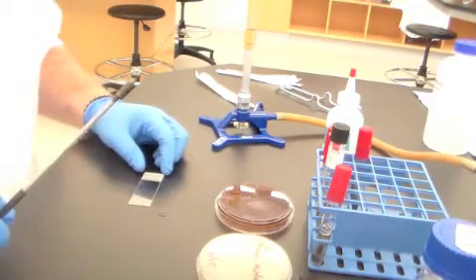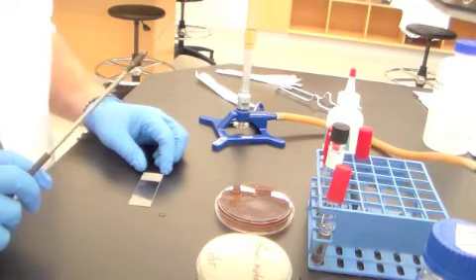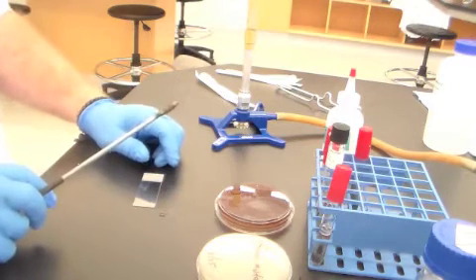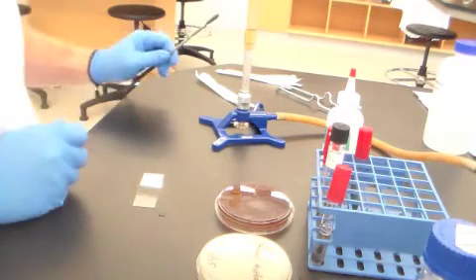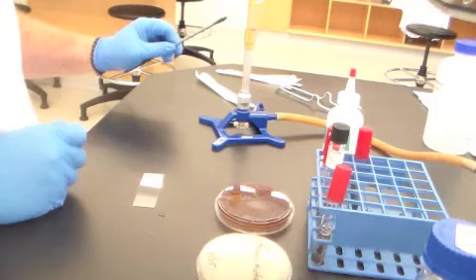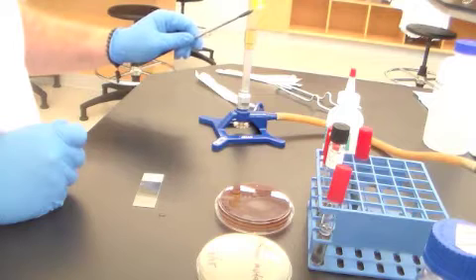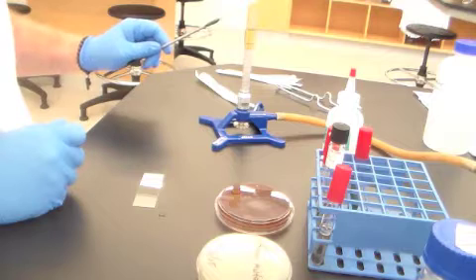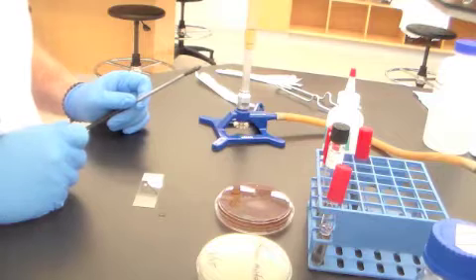It's really assaying whether a bacterium has the ability, or has evolved the ability, to actively deal with the toxic effects of oxygen. So even organisms that grow in the presence of oxygen, that require oxygen, that utilize oxygen, can find it toxic, because during respiration, some of the byproducts of oxygen respiration are not necessarily healthy. So things like singlet oxygen and superoxide radicals occur. And so some bacteria have evolved the ability to detoxify these very toxic reactive oxygen species.